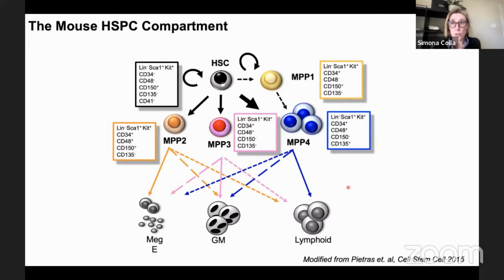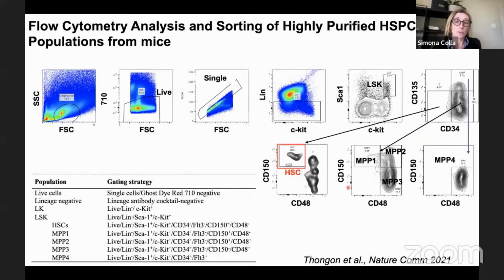So I will present today how to sort the hematopoietic stem cells, because one of the goals was to dissect in the mice the transcriptome and the epigenetics, in particular in the setting of telomere shortening. The goal was to sort this stem cell population, but then go inside, because as I told you before, this population is a mix of cells, each one in a different differentiation state.